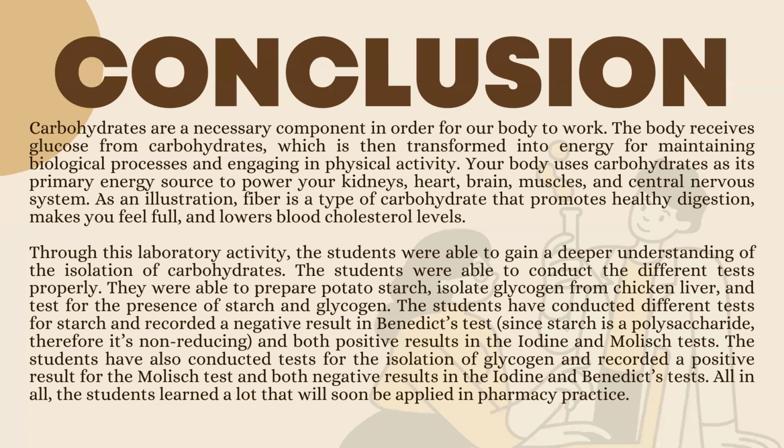Through this activity, the students were able to gain a deeper understanding of the isolation of carbohydrates. The students were able to conduct the different tests properly, and they were able to prepare potato starch, isolate glycogen from chicken liver, and test for the presence of starch and glycogen.